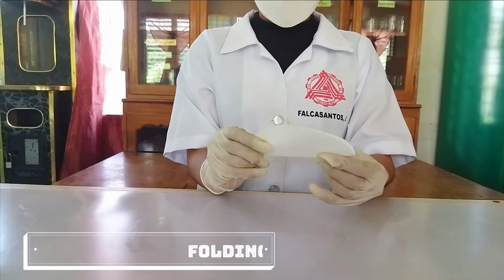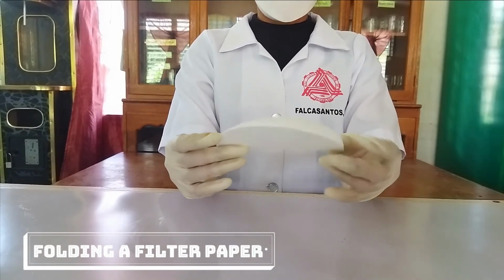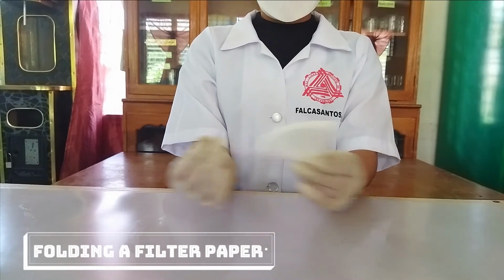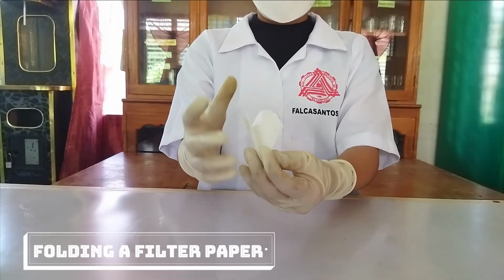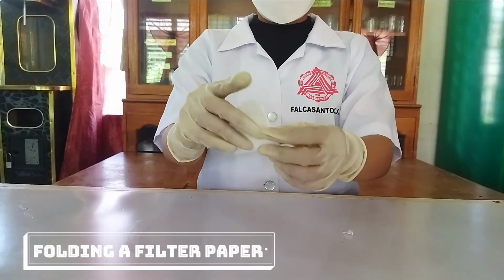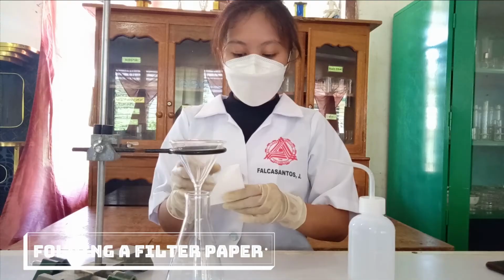Folding a filter paper. First, fold the filter paper in half, then fold it again in half as shown. Next, put the folded filter paper with 3 layers on one side and one layer on the other side to form a funnel. Tear off the tip of one corner. The tear enables a closed seal to be made across the folded portion of the paper. The filter paper should be smaller than the funnel.